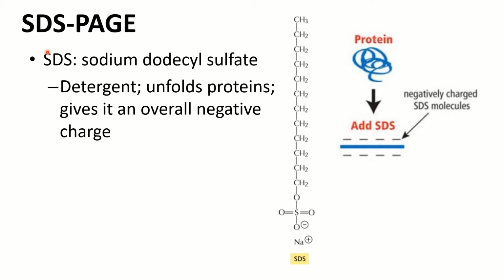And so we need a reagent, SDS, which acts like a detergent, which has a portion that is hydrophobic and a portion that's hydrophilic, also amphipathic in nature, so that when the proteins are actually now free from the cell or from the serum, the SDS may actually stick on the proteins, similar to what's illustrated here.